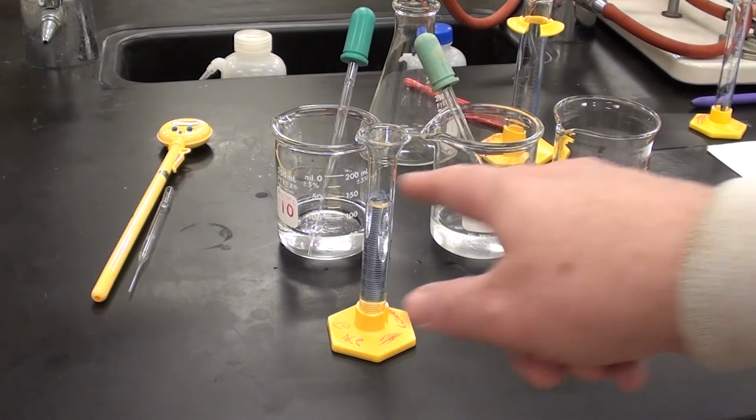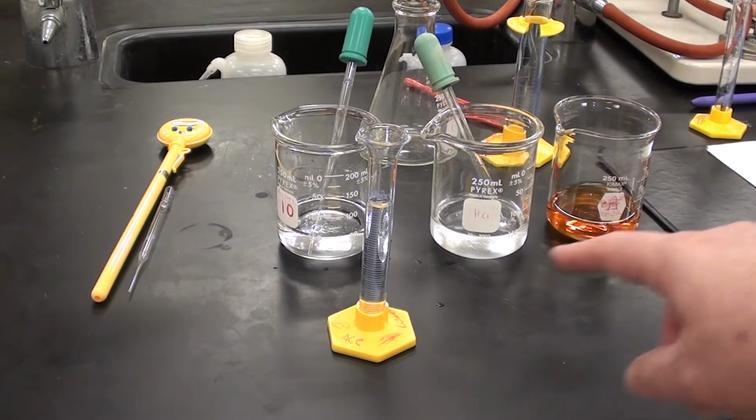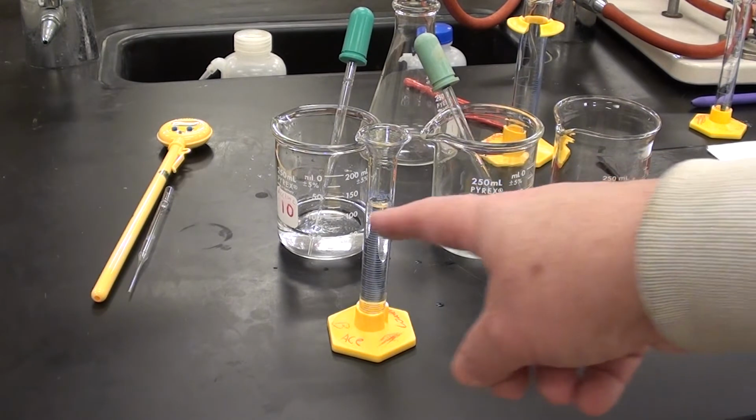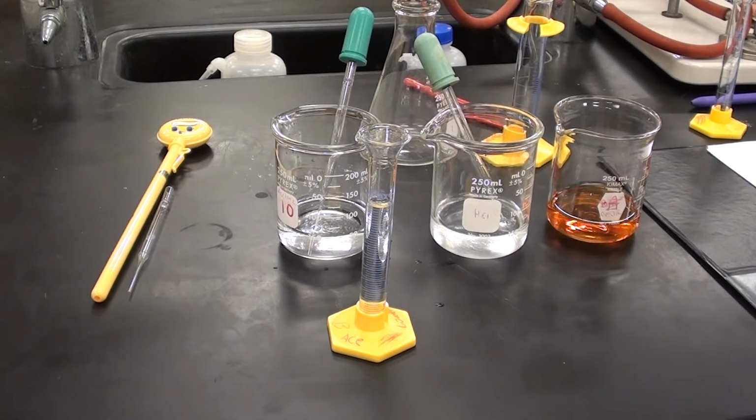You'll notice also that we've got these 3 beakers of liquids here. We've got acetone, we've got HCl, we've got iodine, and it's really important that we label the acetone and the HCl, and these beakers have been labeled. We can't tell the difference between them otherwise.